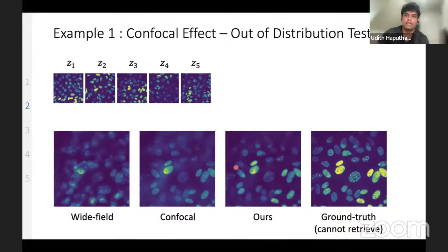Yeah, specifically I tried. I did a grid search for different pinholes, and this is the best result I obtained. But I think I might have to do some experiments for the input illumination part, because currently, as I remember, I just use a field that can focus into a point source. But in terms of pinhole, this is the best result I got for different pinhole sizes.